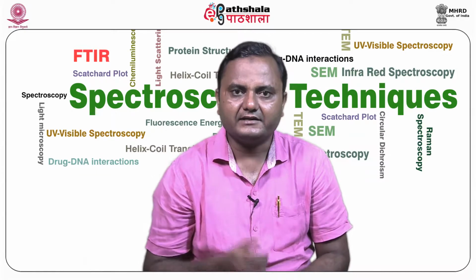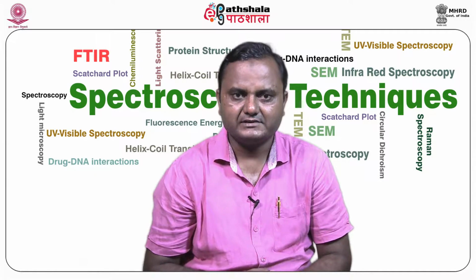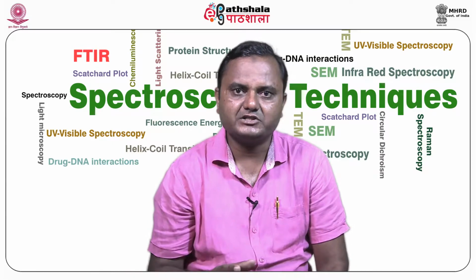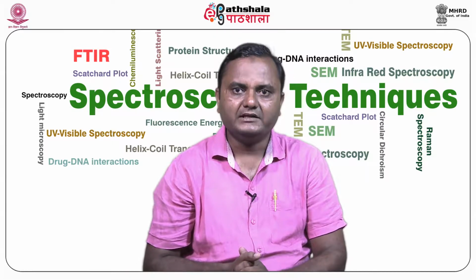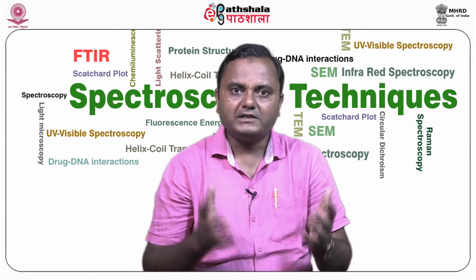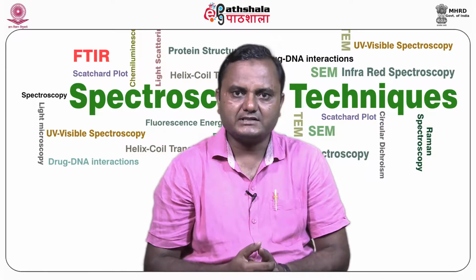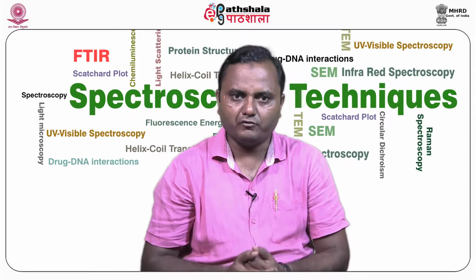A right angle light scattering system has a number of advantages. It is a very straightforward instrument to build without any complicated optical system. All that is required is a flow cell with a window on the side, which allows the cell to have a low volume.